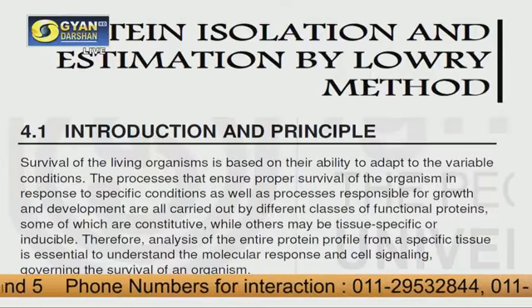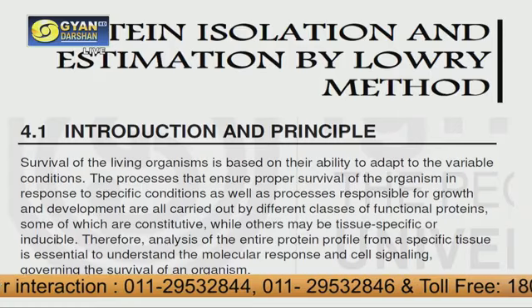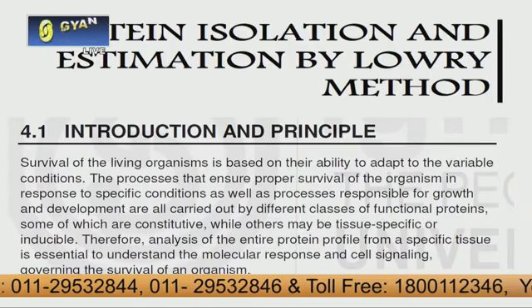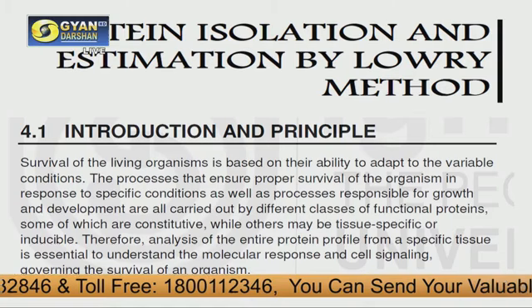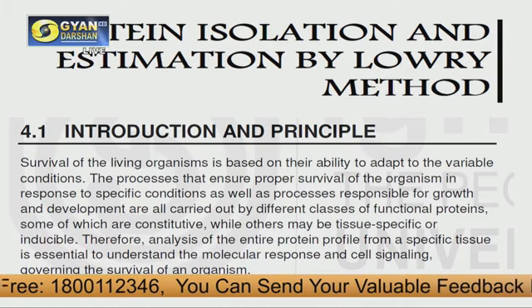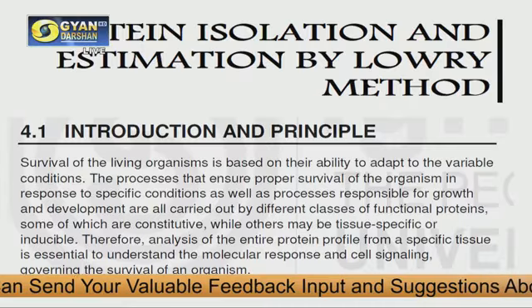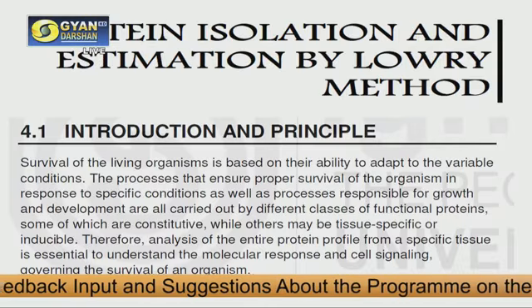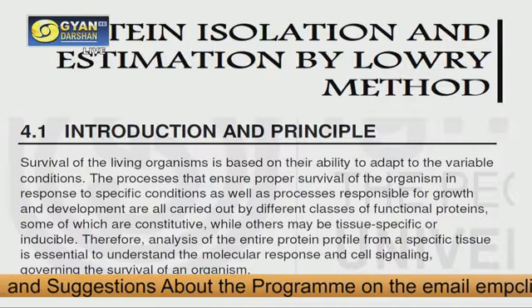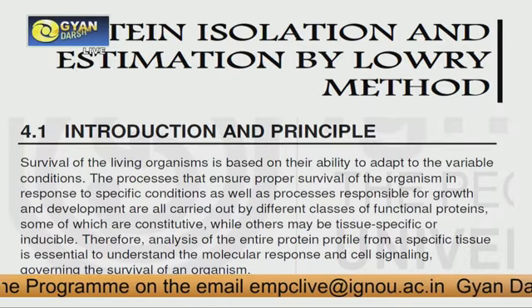Now, once we know how to isolate DNA, we should also know how to isolate a protein and how to estimate the protein content. Qualitative and quantitative. So today's second part of the discussion, the next 2 experiments, will focus on protein isolation and qualitative and quantitative detection of the protein. That means the quality of the protein is being checked and the quantity of the protein is being measured.